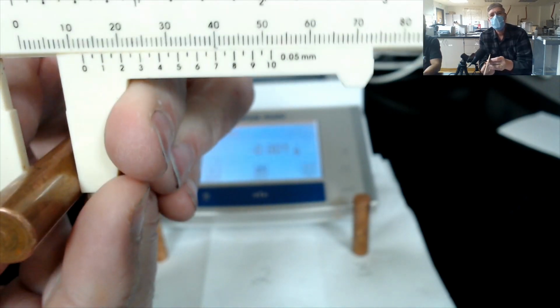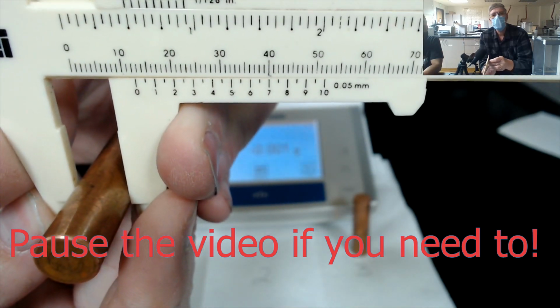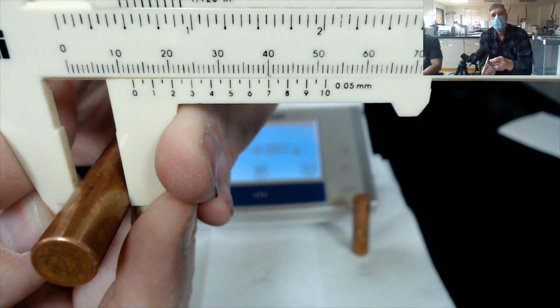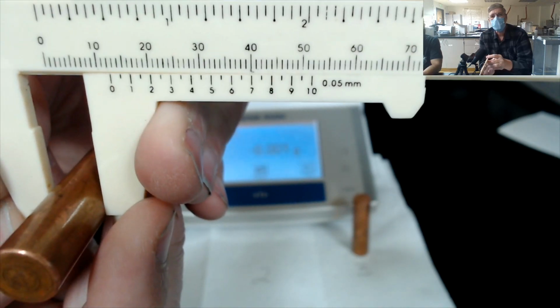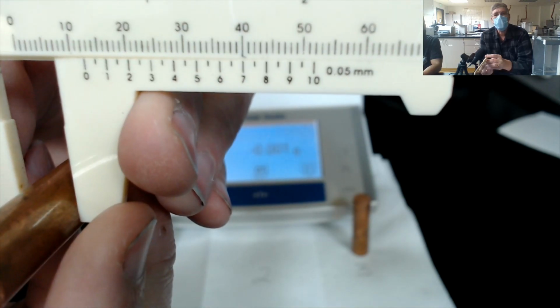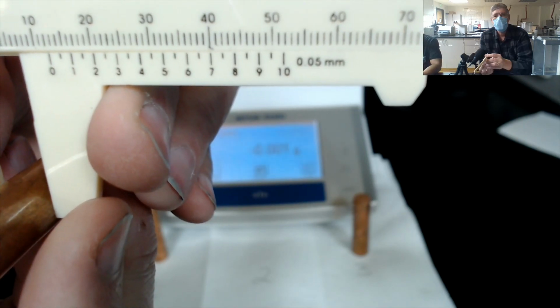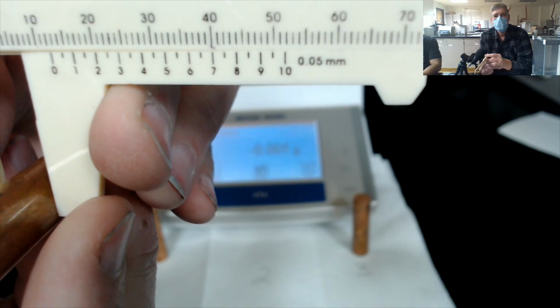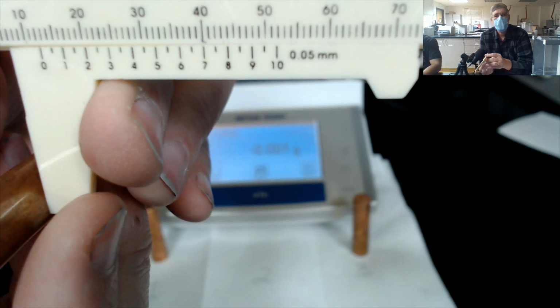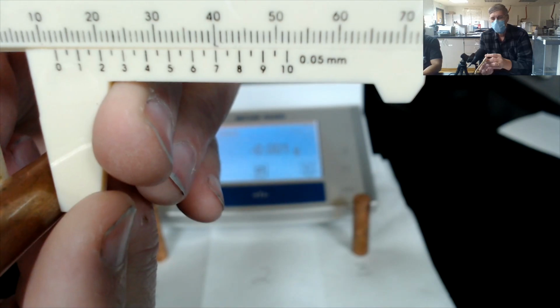First, we'll find the 0 line. Alright. And the 0 line looks about the same as the last one. And now we'll look carefully at those 20 lines. Okay. Have you chosen the one that lines up the best? Record that, and you will have your measurement for the diameter of cylinder 2.